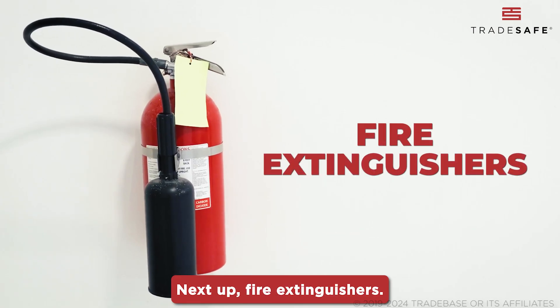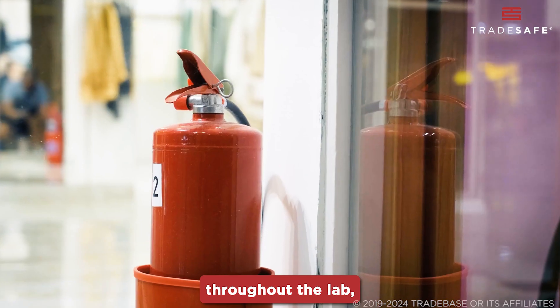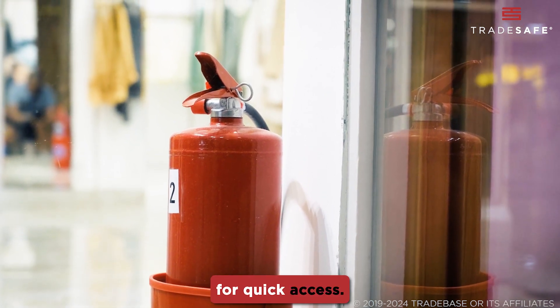Next up, fire extinguishers. These are strategically placed throughout the lab, often near exits, in hallways, and close to high-risk areas for quick access.